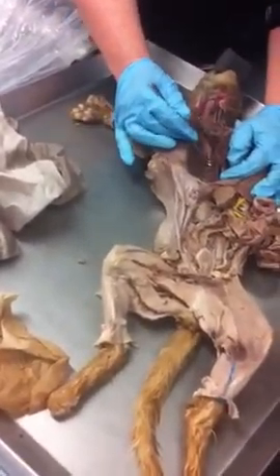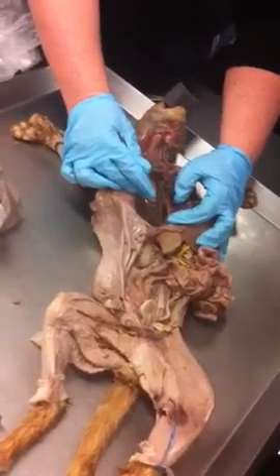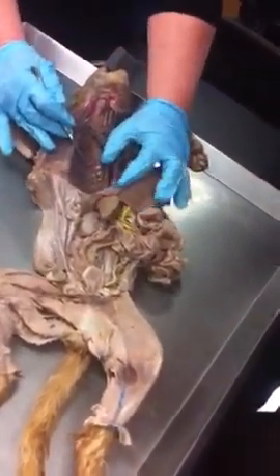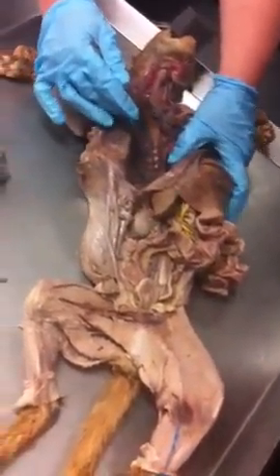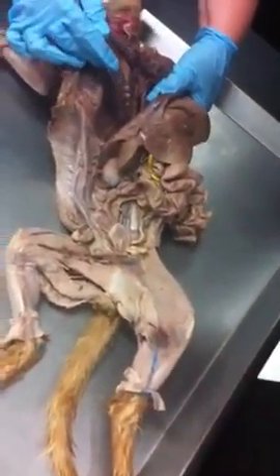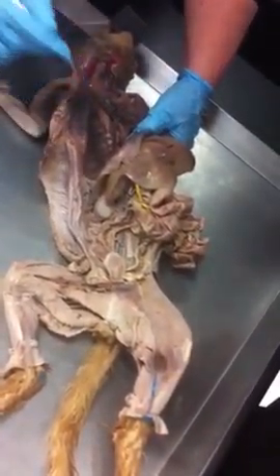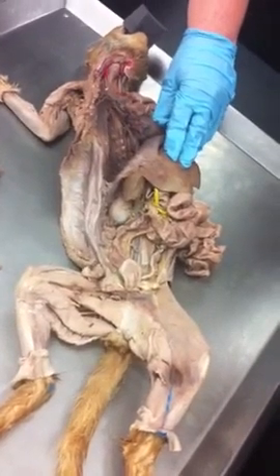What was this vessel here? It comes right up along the side. And can you see the sympathetic trunk right there? Not very impressive. Sympathetic trunk, kind of covered with yellow tissue. Yeah, kind of a golden brown. Looks like dental floss or something. That's the sympathetic trunk.